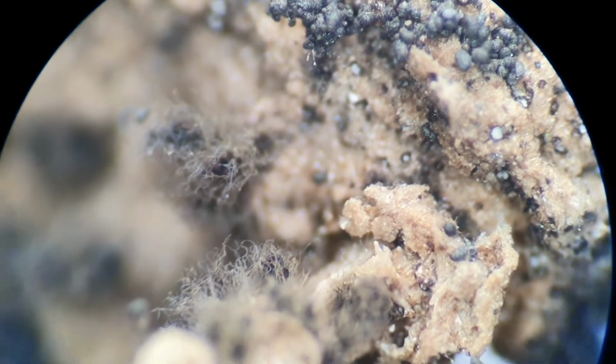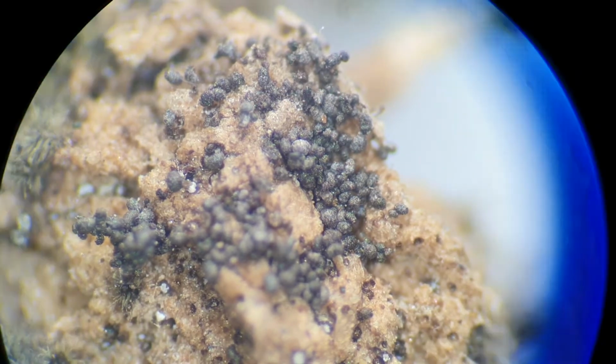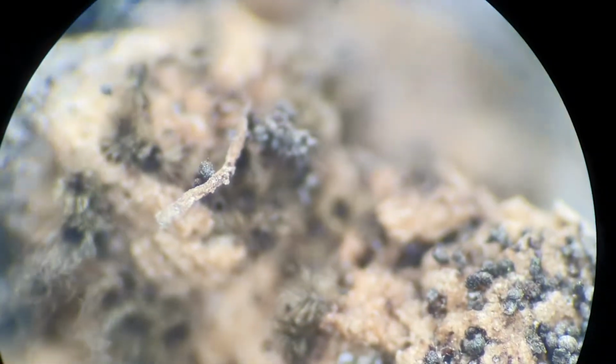And if I move the sample around, you can see the hyphae of that ascomycota species of fungi germinating out of the cleistothecium, right? These ball-like structures, remember, are the fruiting bodies of some ascomycetes, and they contain inside them the spores of that ascomycete, or the ascospores of that ascomycete fungi, right?